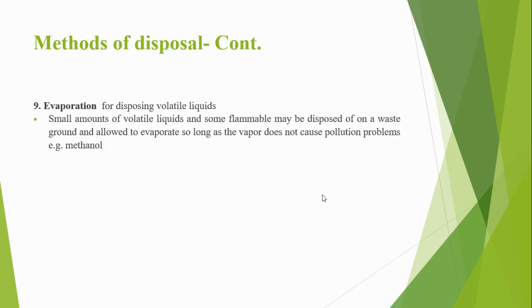Then the next aspect is the evaporation method. This one is used for disposing of volatile liquids. These liquids, you just put them maybe in a dish and then you expose them to the open, then they will turn into vapors and they will escape into the atmosphere.